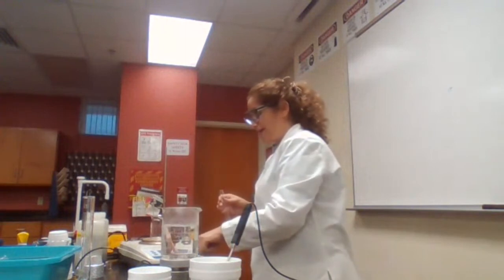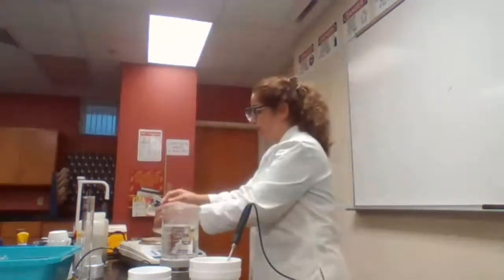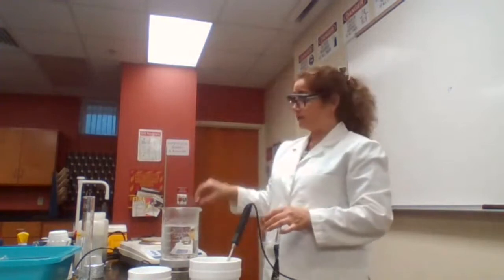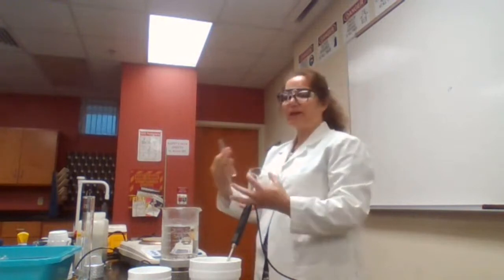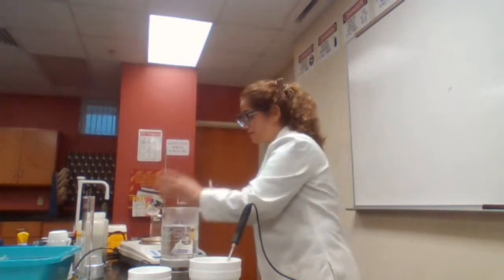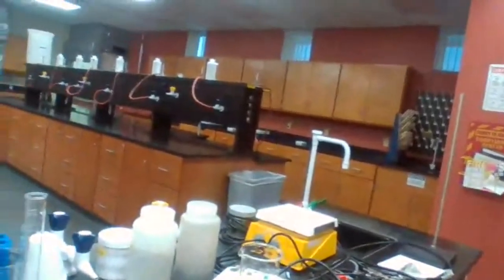the balance. It is good practice, because later on, if I cannot hold on to the test tube, I have to leave it flat, and if I leave it flat, it can roll out of the scale, or some of the metals that I have in there can spill out, and then by collecting, I may not get everything in. So I use a beaker, and I press the tare button, just like how we measured the mass before. Press the tare, I get 0.